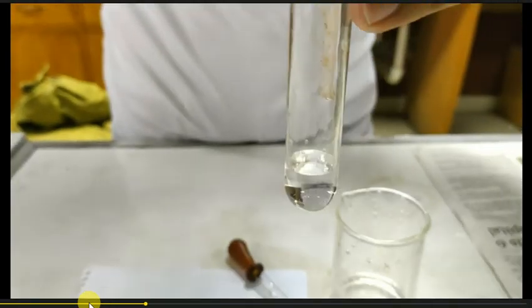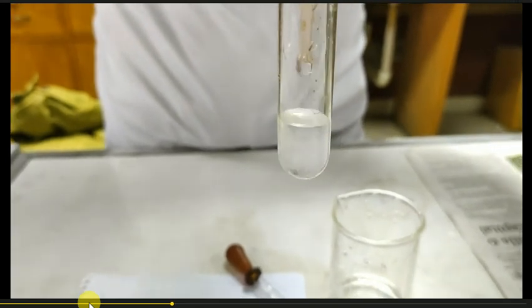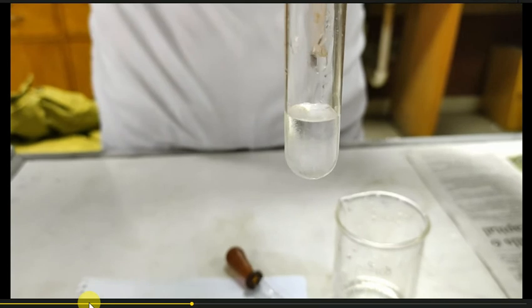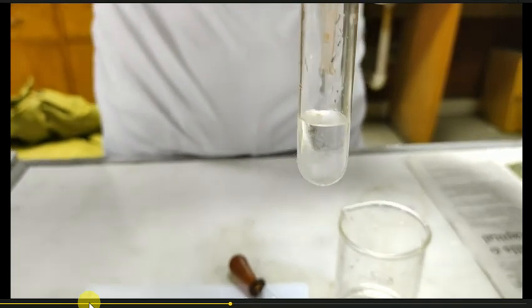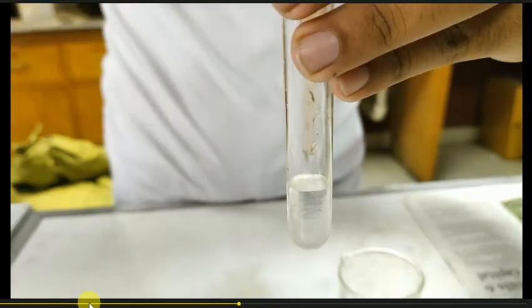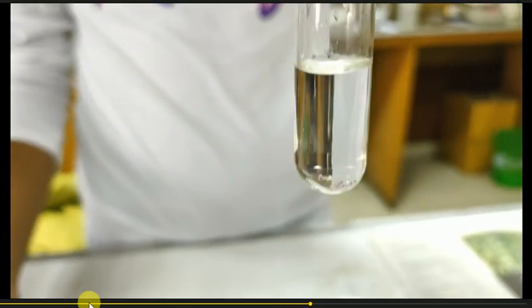This will produce white precipitate, but the excess ammonium hydroxide will cause the precipitate to dissolve. Excess ammonia will dissolve the precipitate. The precipitate dissolves. This is indicative of the presence of zinc ion.